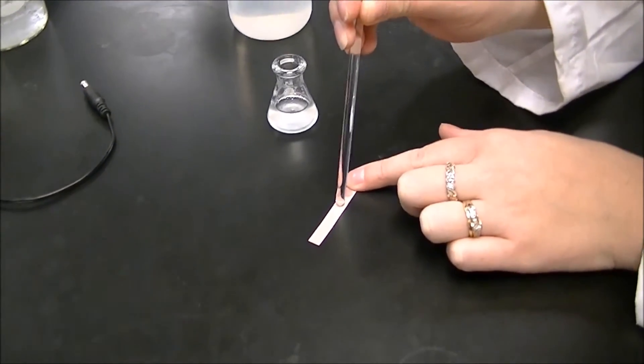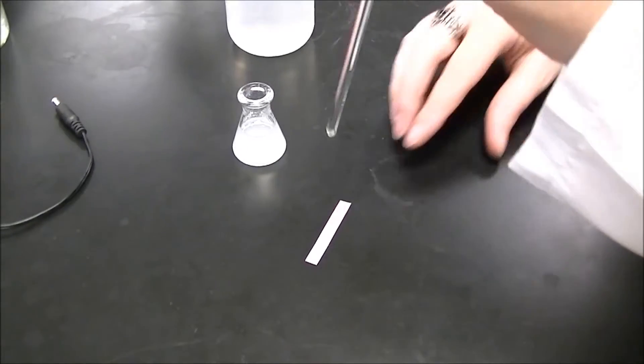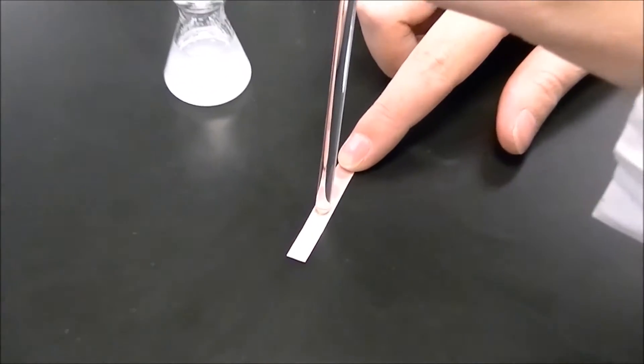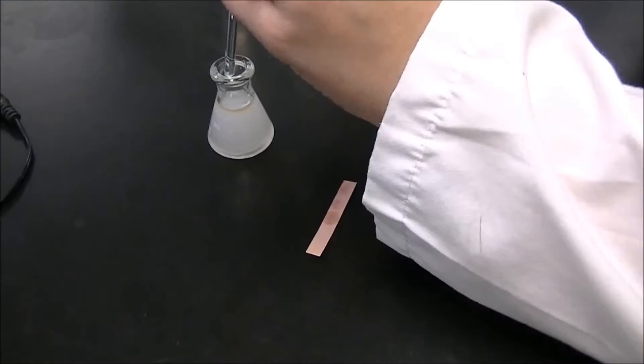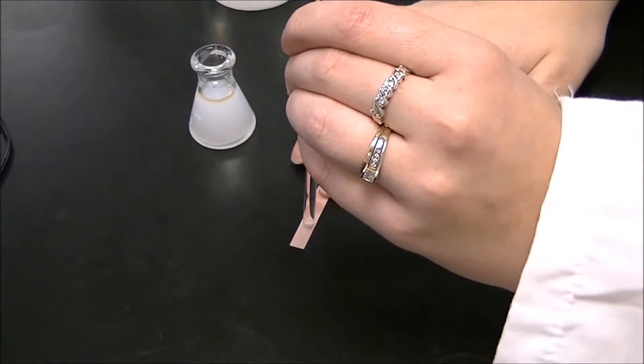Check the pH every 15-20 drops of base by using a glass stir rod and letting a drop touch the red litmus paper. Eventually, you'll see a blue dot indicating that your solution is now basic.